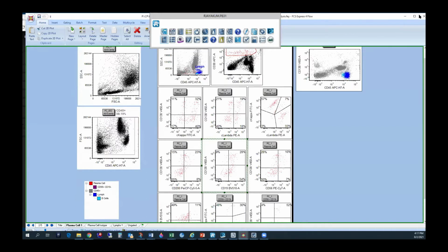Yes. What I've seen, from a lab tech perspective, is that whenever they do a sample, it's done in Navios software, and then it gets dragged into Kaluza software. And as soon as it does that, the lines are never in proper places. So for each case, these positive and negative lines have to be adjusted.